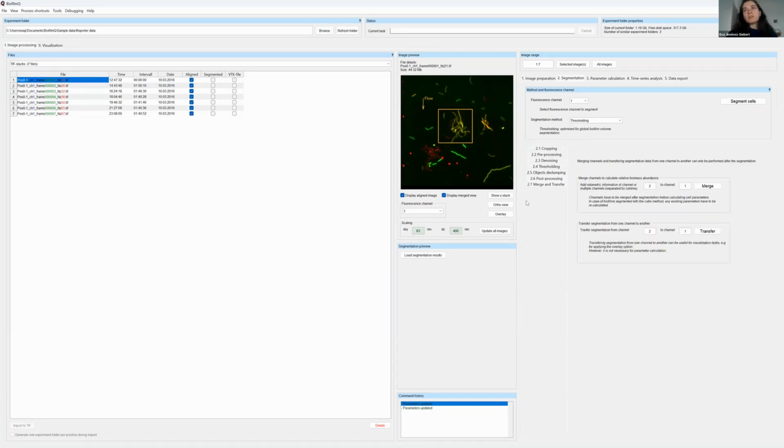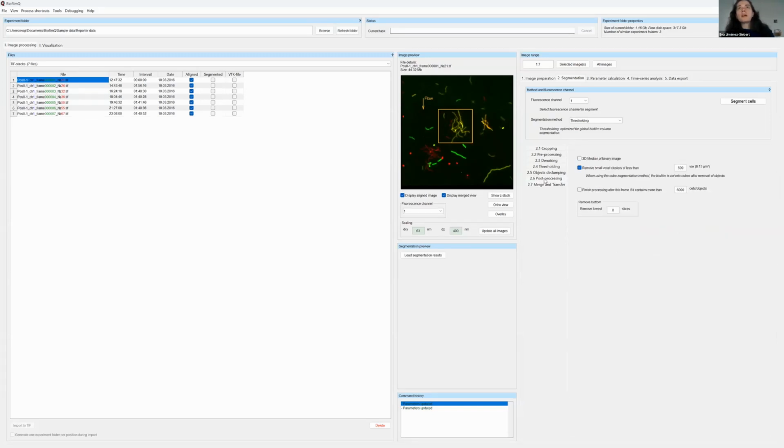And the last tab is about merging different channels. This is a feature that Hannah is going to tackle in her part of the workshop, because this is one of the advanced features that is going to take a bit of time to explain.